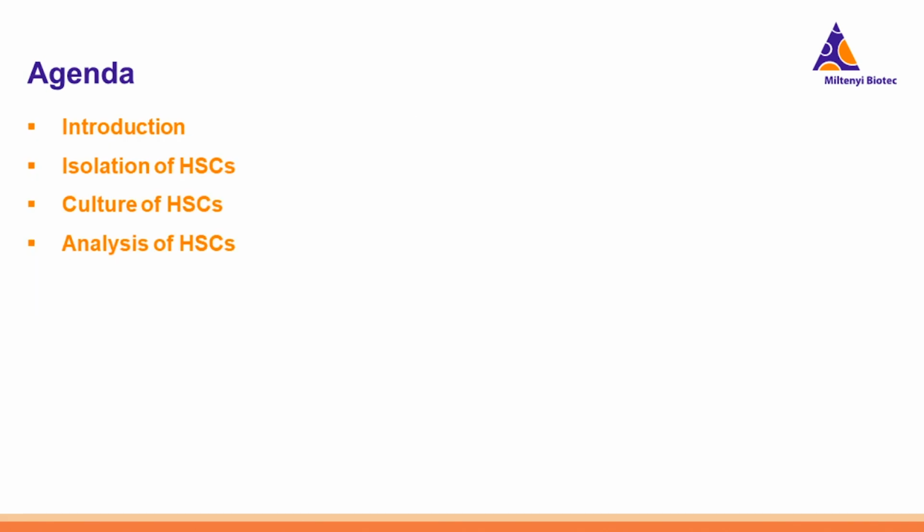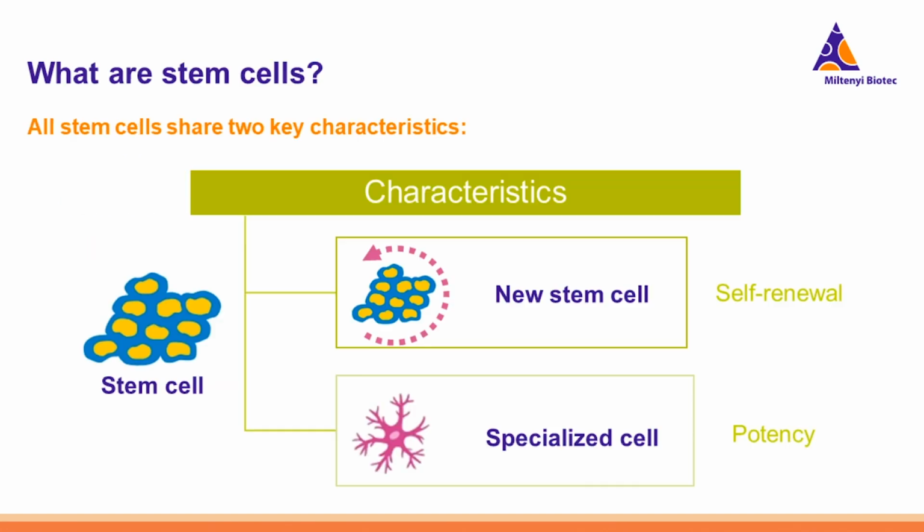At first, I will give you a short introduction, which leads us to the topic of today, the human hematopoietic stem cell HSC research. For human HSC research, we are going to talk about the isolation, the culture, and the analysis of human HSCs. So let's start.